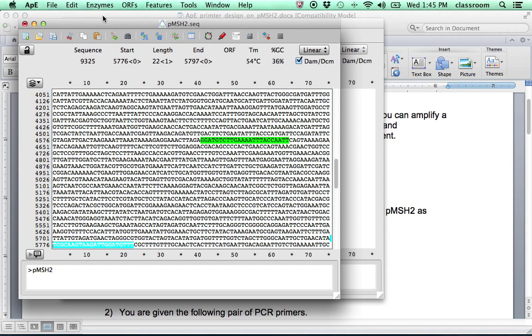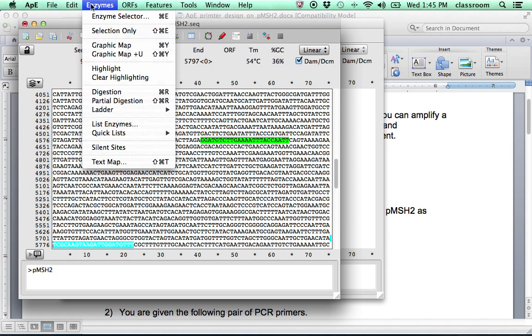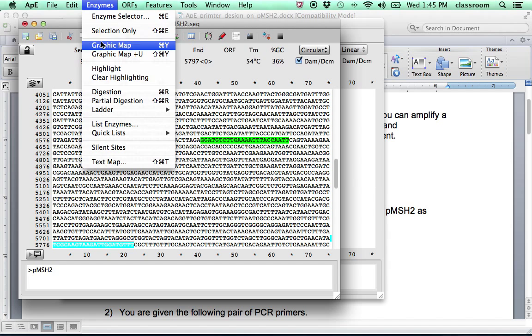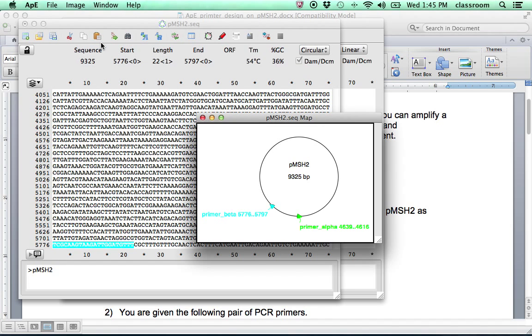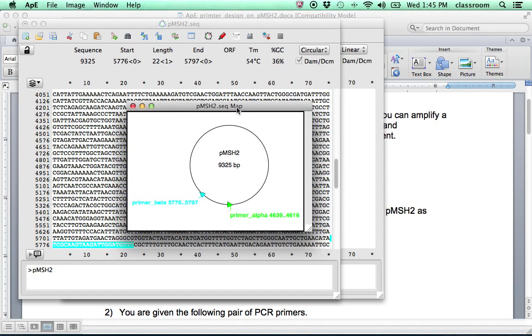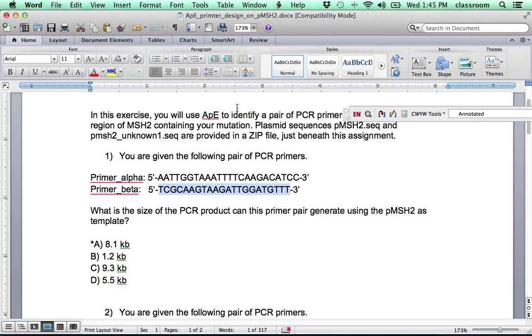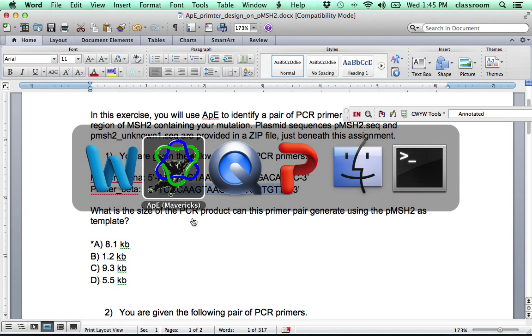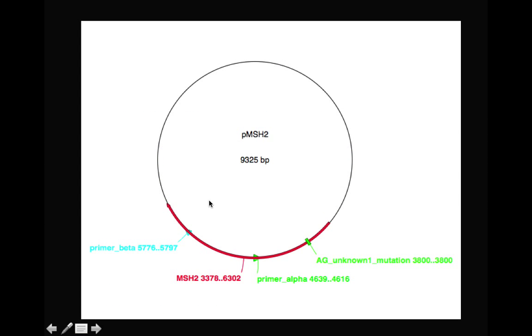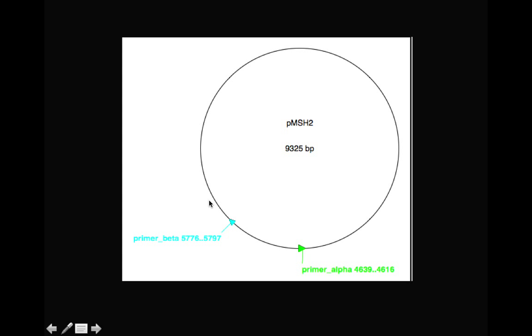And this time, if you look for the, make sure this is circular. And then go to Graphic Map. Now you see primer alpha goes this direction, primer beta goes this direction. And the first question asks us, what's the size of the PCR product of this primer going to generate? So OK. So this is basically the result we have.